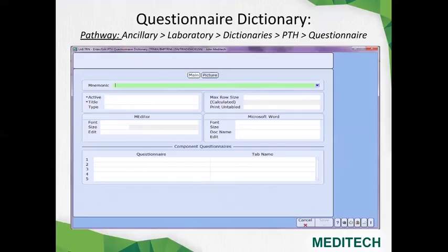Questionnaires can be used to display certain past information from the system. Prompts and responses can print in a variety of different fonts and graphics when printed to a laser printer. Users are able to define their report formats using the NPR report writer application. And the questions on a questionnaire and the length of the response field are first defined in the prompt dictionary, as we just saw with our max length field. And questionnaires are accessed directly from the findings entry routine, and I'll show you a brief overview of the questionnaire once we go through the dictionary.